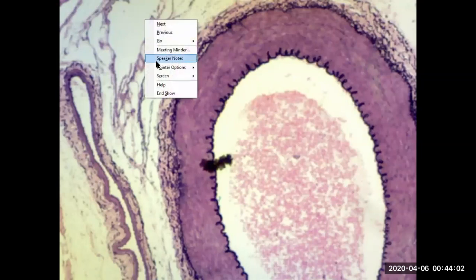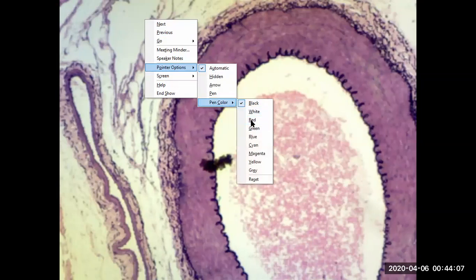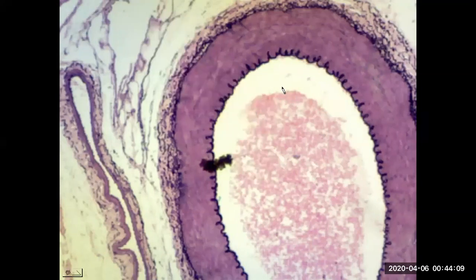So now moving to the tunic layers, we'll start from the inside and work our way out. So again, the hollow space is the lumen on the inside of the blood vessel. And where we see this dark line here, I'm highlighting across it, the inner layer is the tunica intima or tunica interna, either name's fine. The middle layer is the tunica media, and the external layer called tunica externa or tunica adventitia.